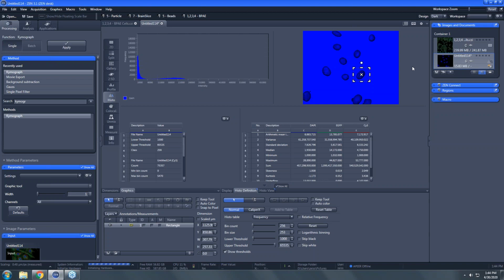Good question, though. We went through that in the rehearsal, and then we decided, for the amount of time it took to describe it and do it, that we had to cut that out for the sake of time. Sorry about that. So we got a histogram tool and we're doing some specific measurements. We've run through sizes of things, dynamics of things, intensities of things, and then a little housekeeping on adjusting all the annotations.